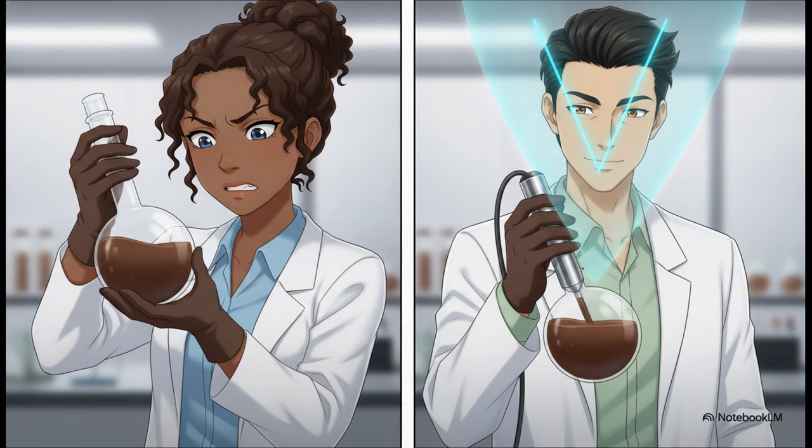So you might be wondering, why go through all this trouble? Well, unlike traditional chemistry that relies on dropping in a dye and just sort of waiting for a subjective color change, conductometry doesn't care at all what the liquid looks like. This method gives us a mathematically precise, graphical endpoint even in completely murky, dark, or highly colored liquids where a standard visual indicator would be, frankly, useless.